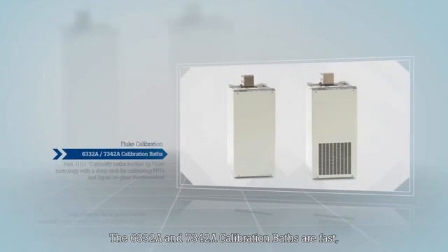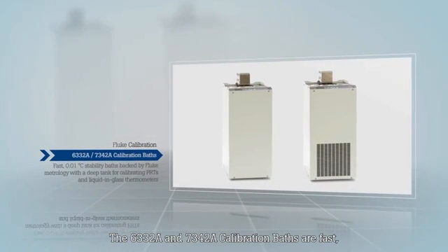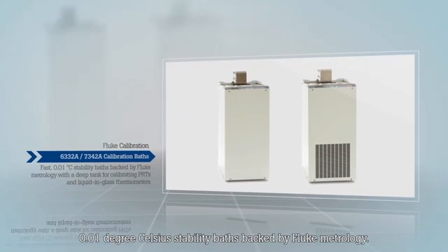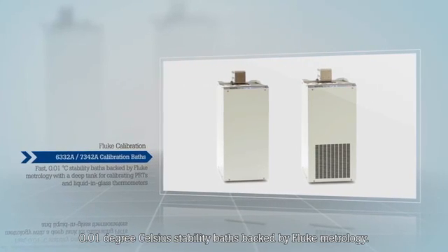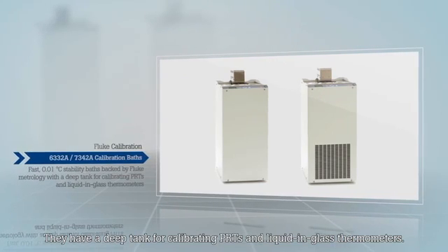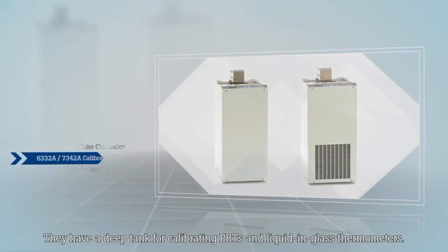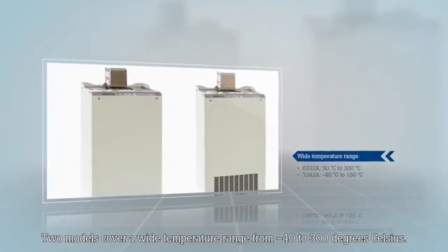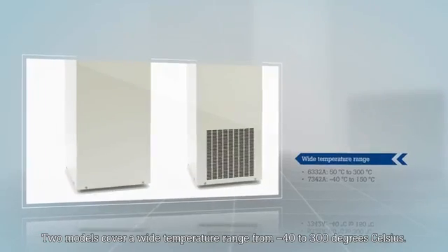The 6332 and 7342 calibration baths are fast 0.01 degree Celsius stability baths backed by Fluke Metrology. They have a deep tank for calibrating PRTs and liquid-in-glass thermometers. Two models cover a wide temperature range from minus 40 to 300 degrees Celsius.